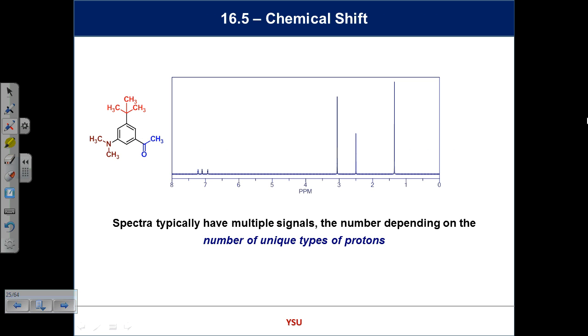Okay, moving on. Now, fortunately, the graphs can be much more complicated, because much more complicated means much more information. And you must see now that each different type of proton in a molecule will have its individual resonance. It will have an individual signal in that spectrum. And we can start off making it more complicated by looking at a simple system like that. Is there any symmetry in that system? No, right? There isn't much of any symmetry.